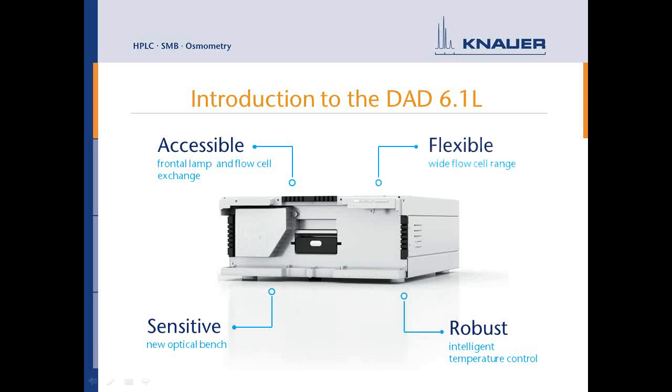But the main focus today is going to be the flexibility of this device. We're going to see how we can use this one device, just by changing the flow cell, for a wide range of different applications.